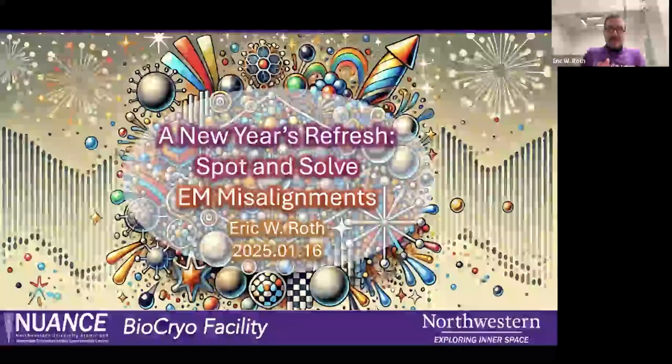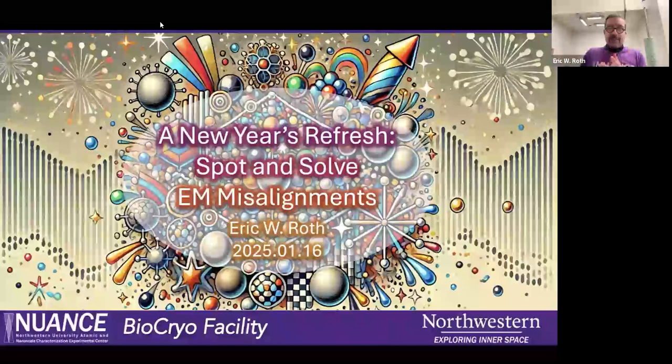I'm Eric Roth with Nuance's BioCryo facility, and I have the honor of kicking off our new year of Tech Talks. So here we are. I'm going to give a talk about spotting and solving EM misalignments. This is kind of a back to the basics approach to learning EM.